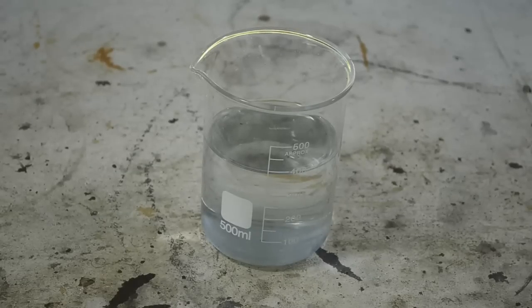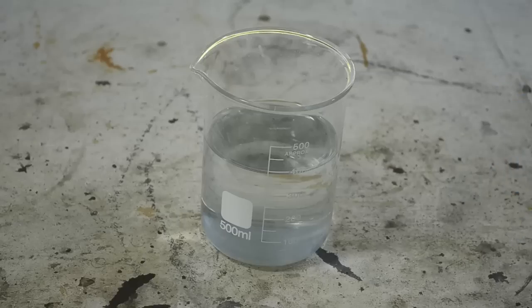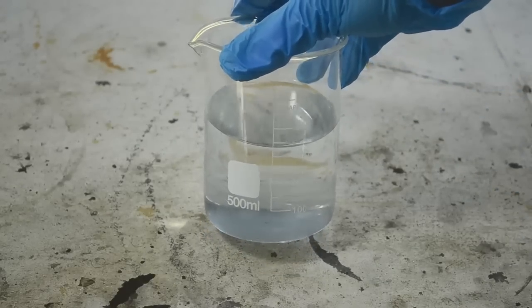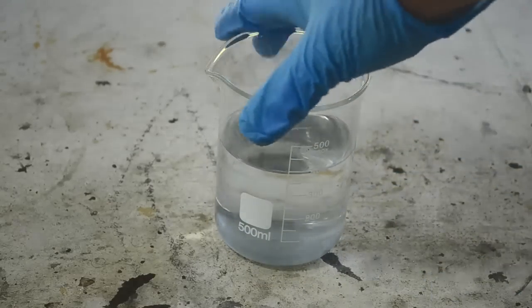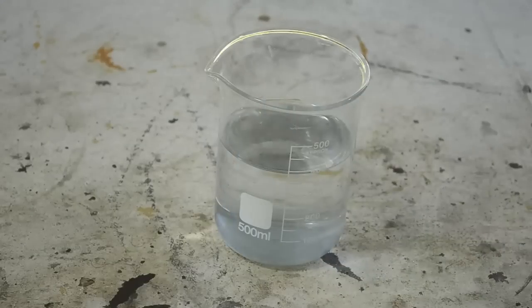Now as for this stuff, I just pulled this out of the fridge. It's been in there, it's good and cold, just above freezing. There is a little film of something on the bottom of the beaker. Not very much. It's a pretty transparent film, but there's a light film of something there. So there's obviously not a whole lot of silver sulfate in here, or it would have crashed out of solution once the temperature went down. But there still could be some silver sulfate in there.